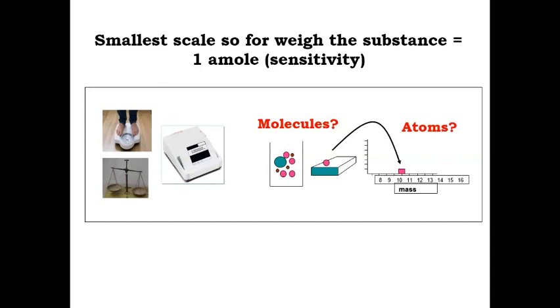Spectroscopy may be atomic or molecular. With mass, we have to write spectrometry, because mass spectrometry is not a spectroscopic technique. It is a separation technique. So we should be aware of the term mass spectrometry and what its application is.